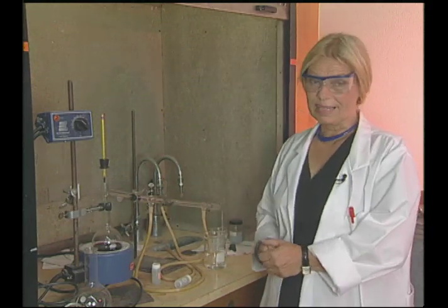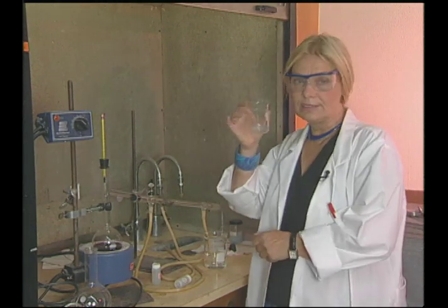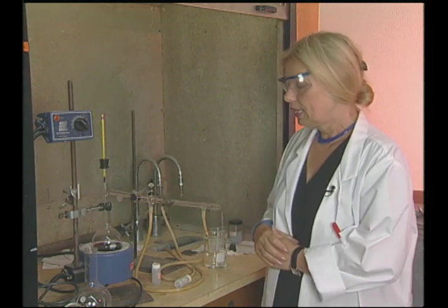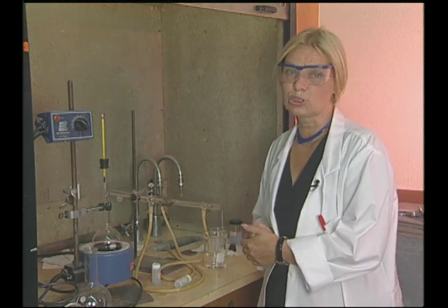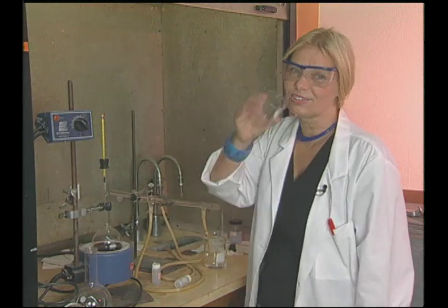Now, what do you expect will be the color of the distillate? The fraction that we will collect here on the other end of the distillation apparatus. Well, naturally, since we have a pure separation, we should obtain pure H2O, pure water. And if I am daring, I could drink it later on.